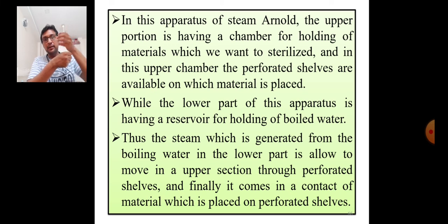The upper chamber is just like a cupboard. We are opening that upper chamber. We are placing our materials.